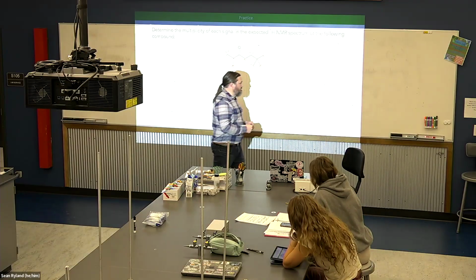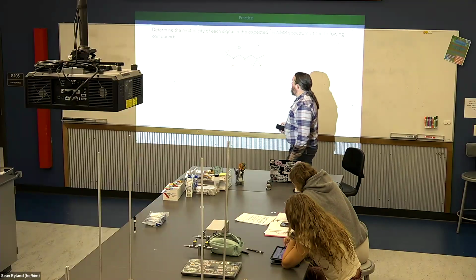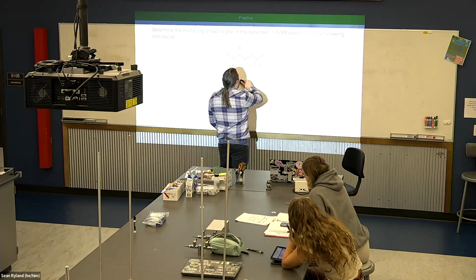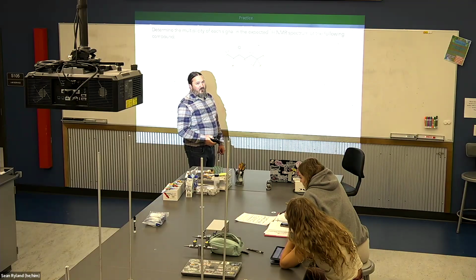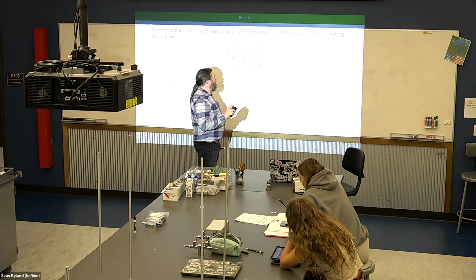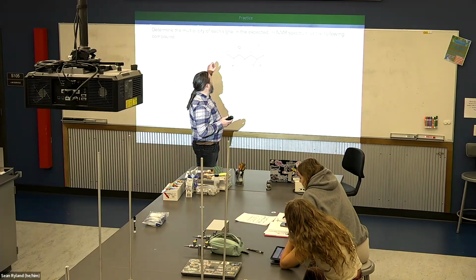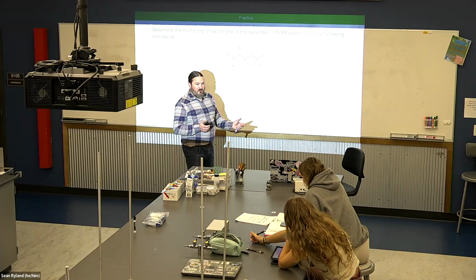Oh, I missed that one. How many different signals should we see? How many different protons can we tell the difference? Which means basically how many different carbons have hydrogens attached. That's how we know if they're different or not.